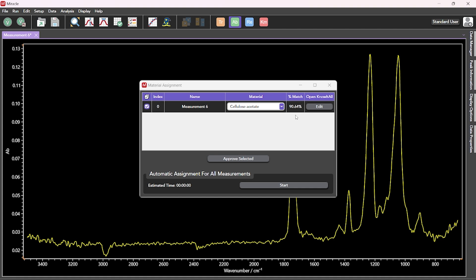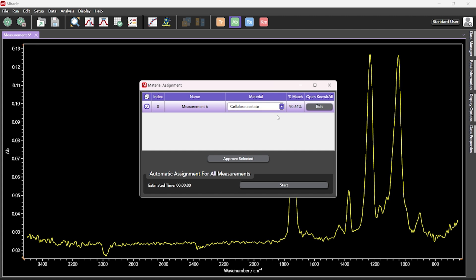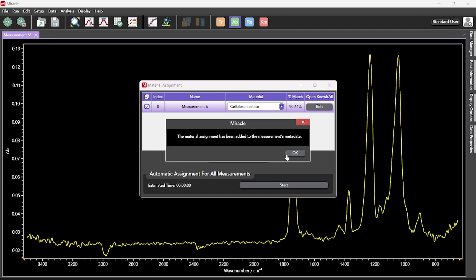The percentage match section indicates the level of similarity between the obtained spectrum and the reference spectra within the database. In this case we have cellulose acetate with a percentage match of 90.64 percent. Other potential matches and their percentage match can be viewed by clicking on the arrow in the materials section.